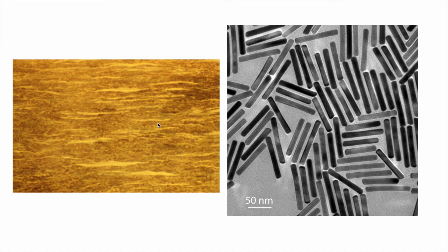So specific crystallographic directions will be sort of aligned with this direction. So this isn't like the powder sample, because these are no longer random. This sample now has a preferred orientation. So if I put this sample in an X-ray diffractometer, there's no longer going to be these random crystals. There's going to be highly aligned crystals in one direction.